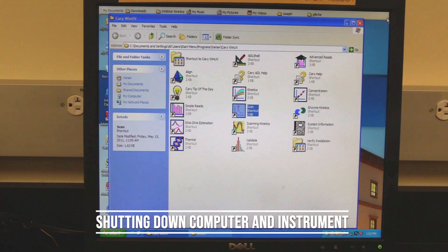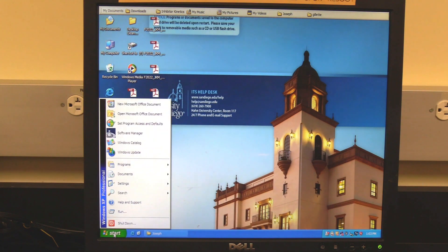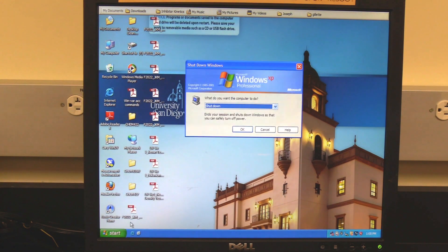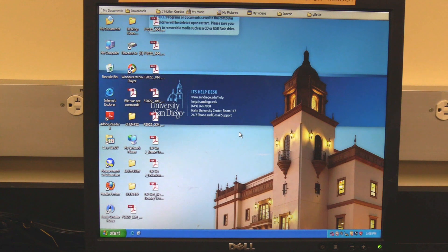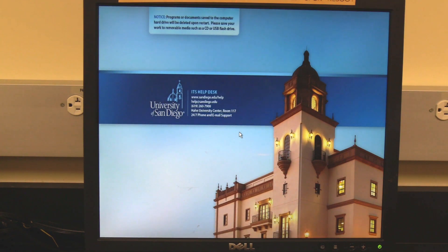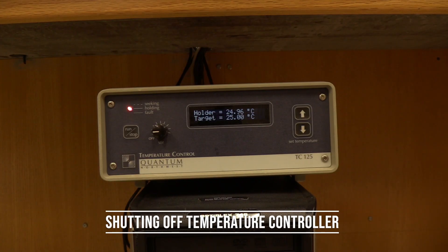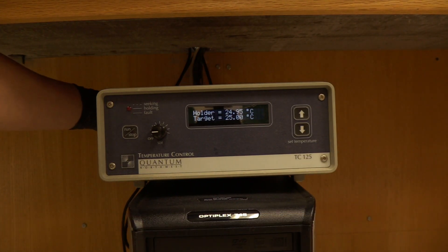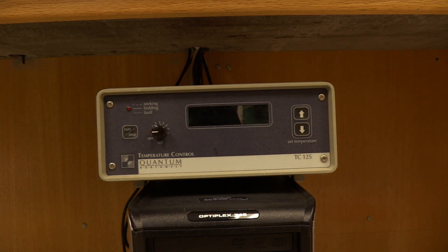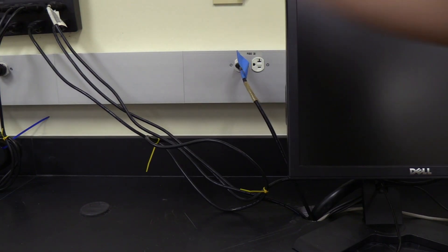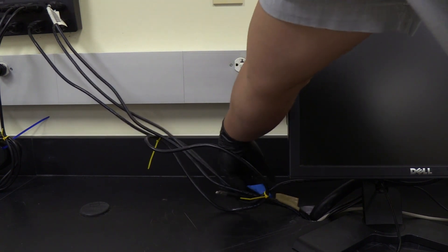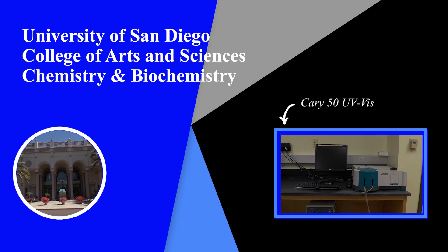Shutting down the computer and instrument. Close the software and Cary Win UV folder, then shut down the computer. It is important the computer be shut down because the instrument is powered through the computer. The instrument power light should turn off, turning off the temperature control unit. Flip the power switch on the back left corner of the temperature control unit. Unplug the pump power cable from the outlet. The instrument SOP should be located next to the instrument. If assistance is needed, please look in the instrument SOP for the contact information of the Scientific Instrument Specialist.